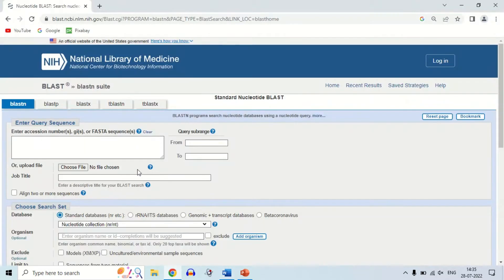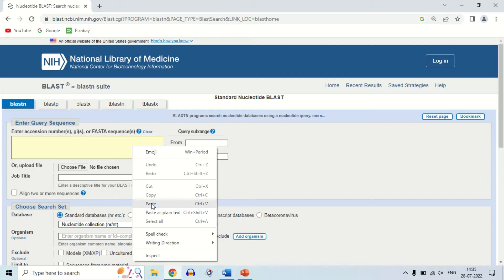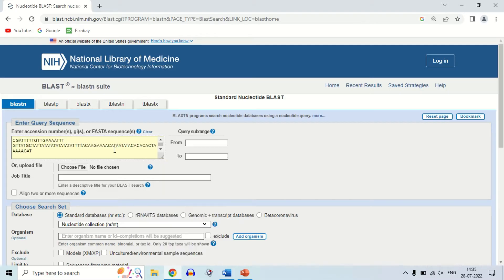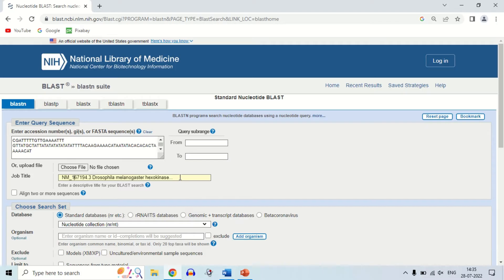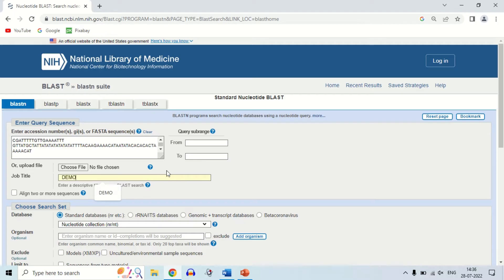When you copy it, move back to the BLAST window and paste the sequence you just copied. The next option is 'Choose File' — you can directly upload the file from which you copied the sequence. The next option is job title, where you can enter a title. Since I didn't give a title initially, it automatically showed the query title. Now I am giving the title 'demo blast' because I am showing you a demo of BLAST.